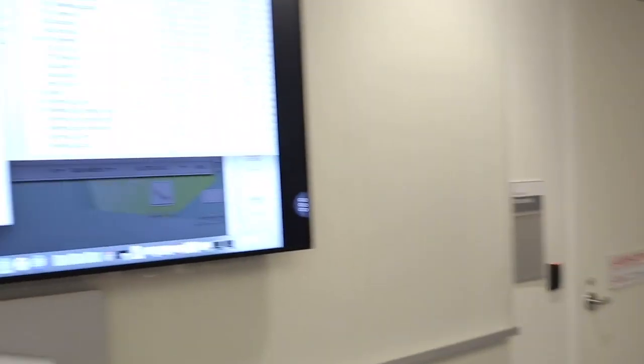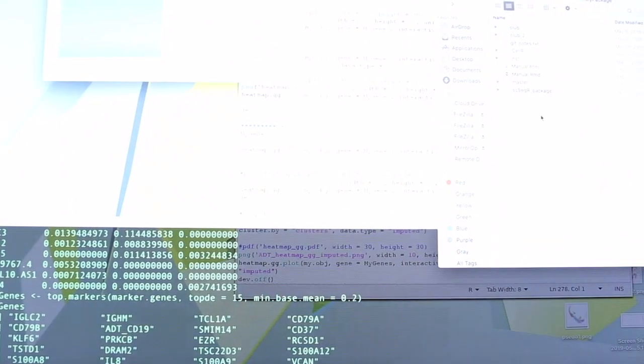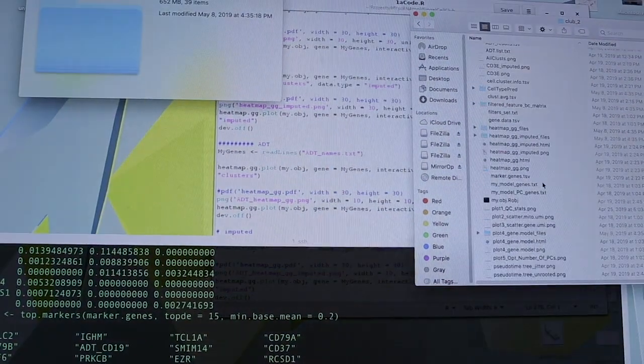So here, let me see if I can find those. This is maybe not in here. Probably put it somewhere else.